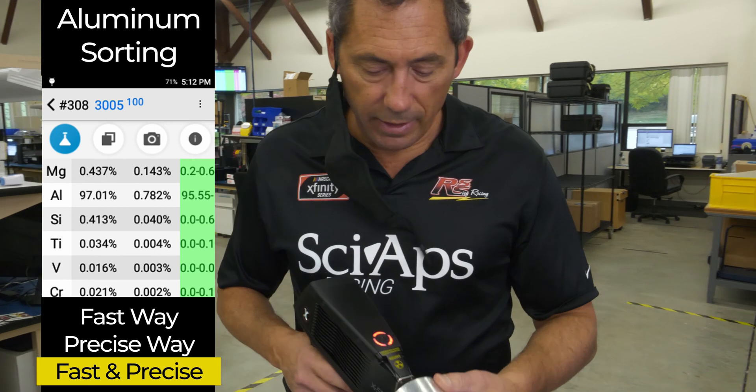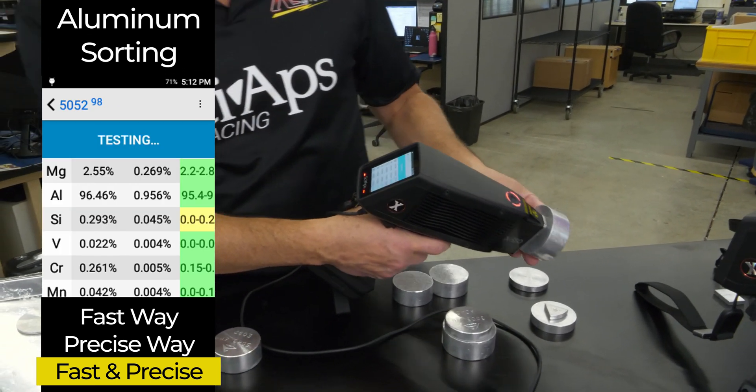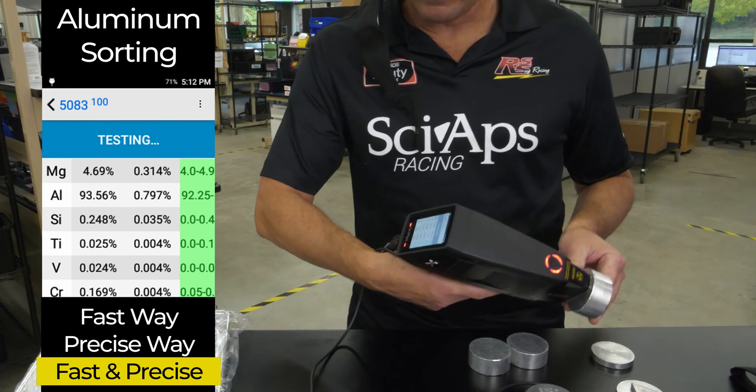The other stuff is kind of run of the mill. You got a 5052 — that's just a really fast one-second test. Here's your 2.5% magnesium. And 5083, even higher, about 4.5% or so — one-second test. There's your 5083.